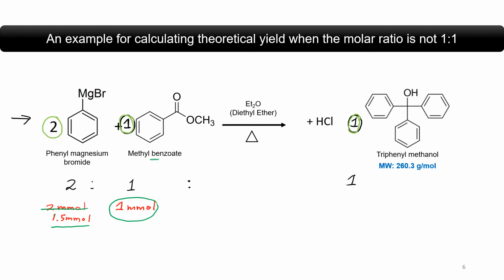It turned out we only had 1.5 millimoles. So in that case, actually, this reagent will be the limiting reagent.